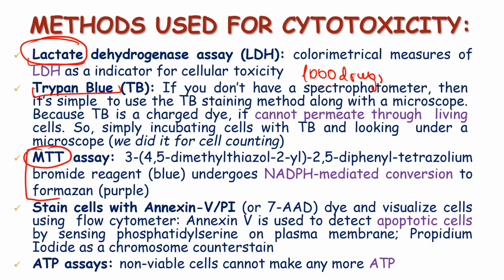In Alamar Blue, it's the change of color and intensity. In MTT, it is solubilization. So in this case, MTT sediments as crystals. And then after you dissolve it in DMSO, you can actually measure the absorbance, and by this absorbance, you could obtain the number of cells, etc., etc.